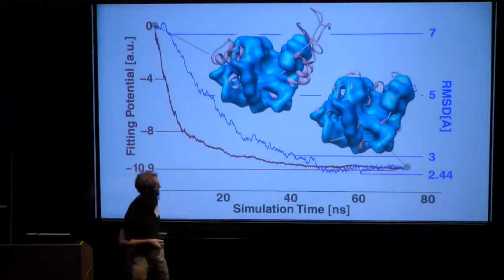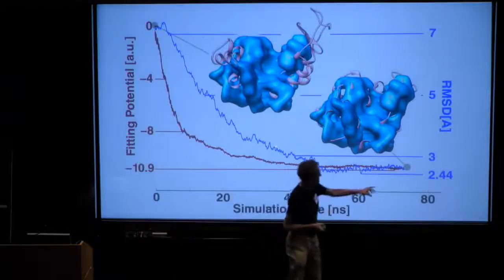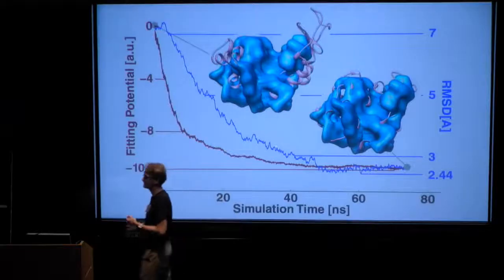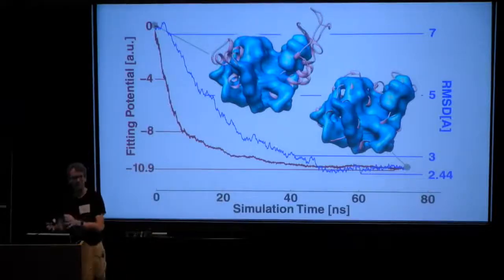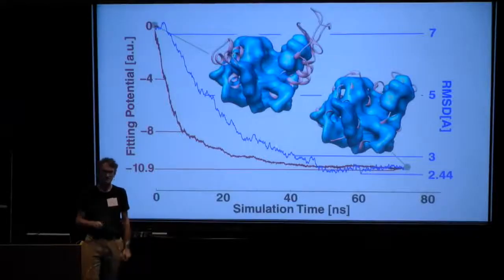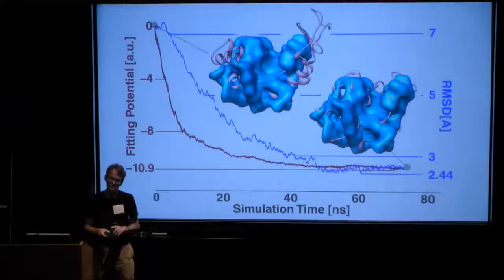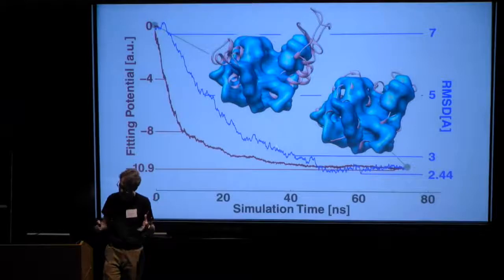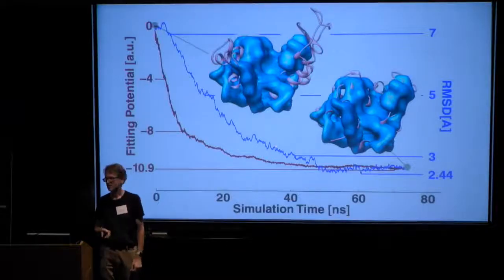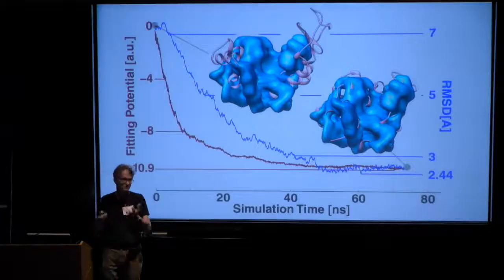And when I'm actually down here, I don't necessarily need to stop, because here I'm actually sampling the ensemble of a molecule under the side condition that I'm sticking to the part of phase space that corresponds to the density that I'm seeing in cryo. And that's important, because I'm a molecular mechanics person, but molecular mechanics is great locally. You will get hydrogen bonds right, you will get the local torsions right. Where simulations have a huge problem is getting large motions right, because we can't sample that. But that is the one thing we get from cryo.